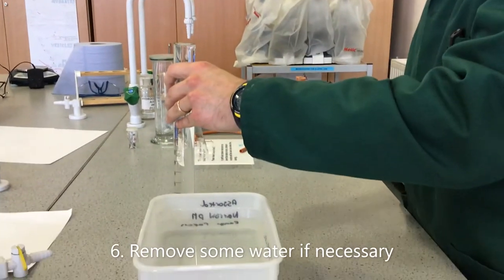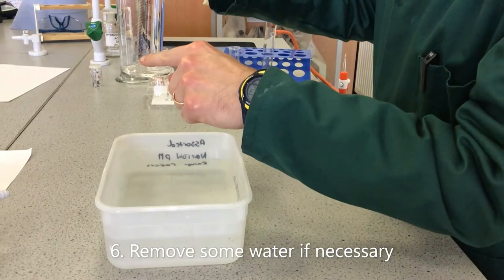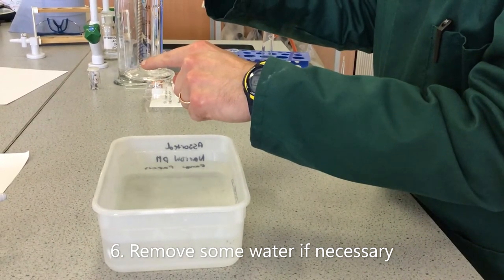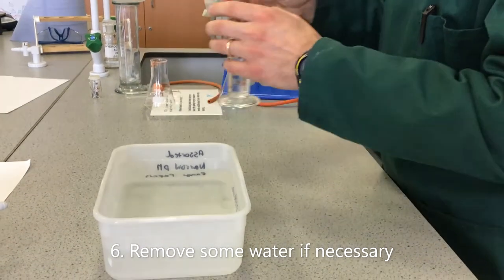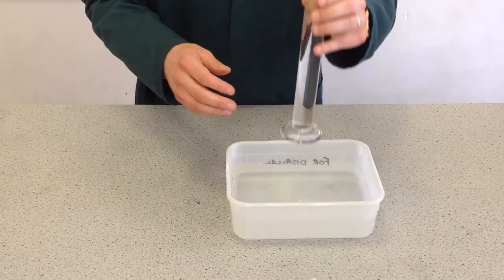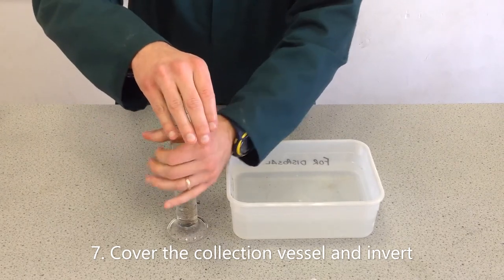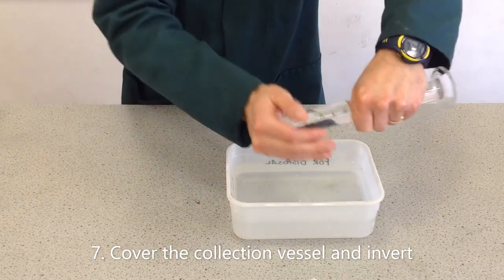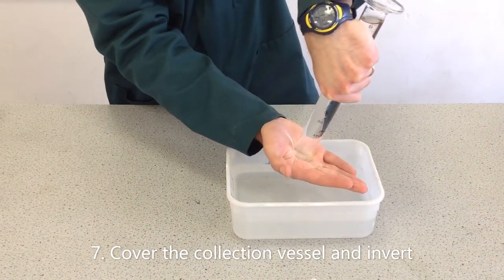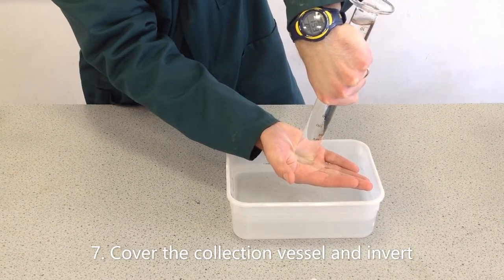I've filled the measuring cylinder right to the brim, but looking at it, I can see the graduations don't start until slightly above the base. So in order to get an accurate reading of exactly what volume I start with, I'm going to pour just a little away. Now for the tricky part: I'm going to place my hand on top of the measuring cylinder and invert it, making sure I keep good pressure on it. I'll then put my hand under the water with the measuring cylinder and only remove my hand once everything is under water.